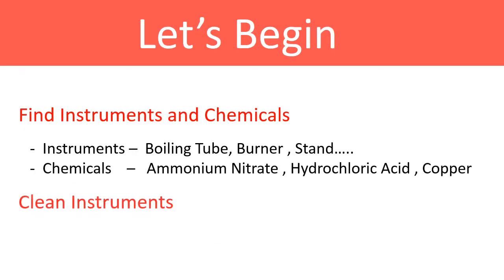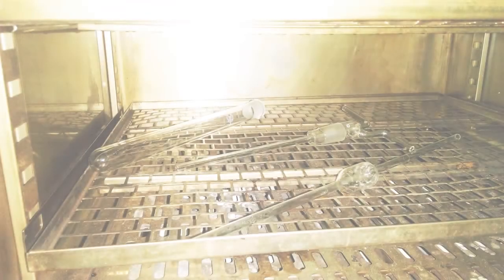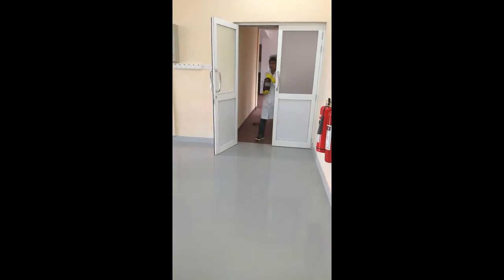Let's begin. Ammonium nitrate, hydrochloric acid, and copper pieces are required for this experiment. We have used several glassware to set up the apparatus which you can see later. First, we have washed and dried the instruments.